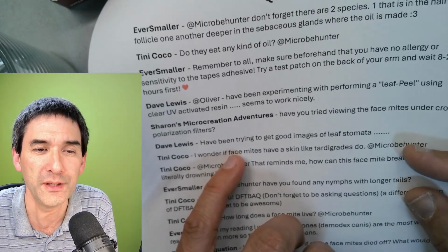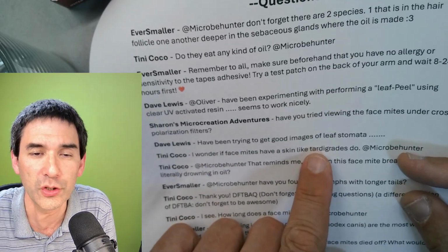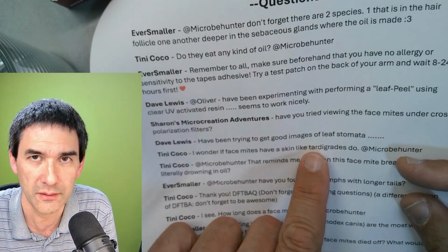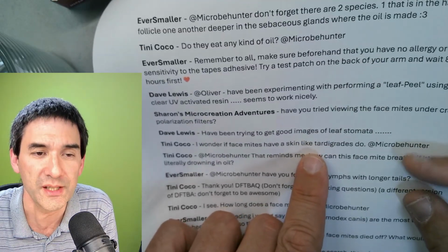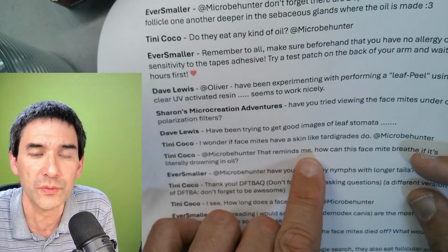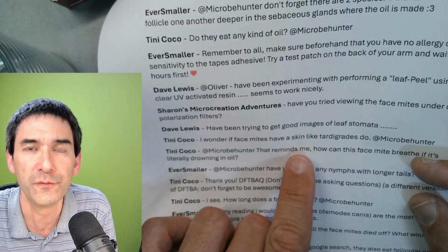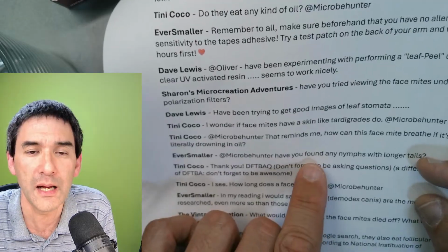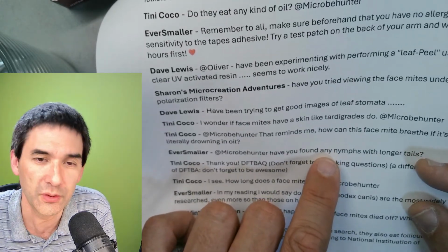By the leaf imprints. Do they have a skin like tardigrades do? As far as I know, tardigrades have a skin made of chitin and face mites as well. So in that sense, chemically, it seems to be similar. Please, somebody research this. How can it breathe? The reason is because the oxygen diffuses through the oil, and it also diffuses through the skin of the face mite. I don't know if the one that we've seen before was actually a nymph. I have to tell you, I don't know.